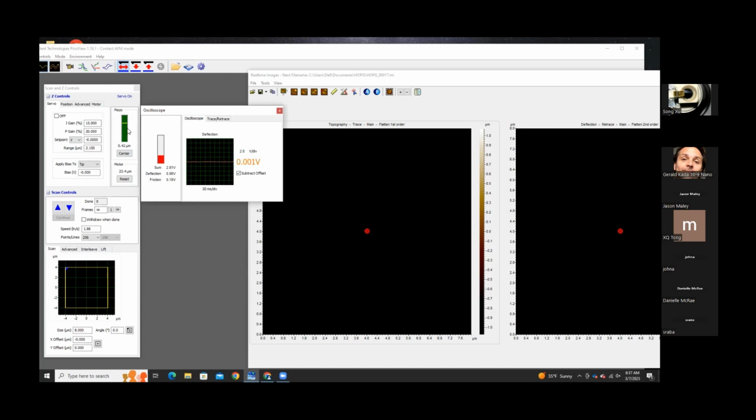Okay, so how do you move back? You can use your finger to move the knobs back a little bit, or you could use the motor function here. You turn one motor, rear, left or right, any one of these, and you click, in this case, open.